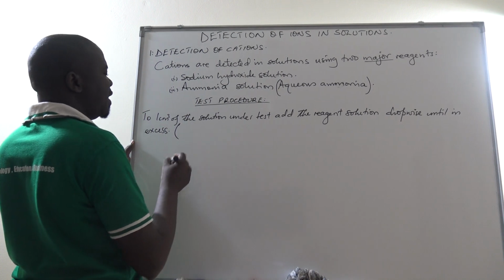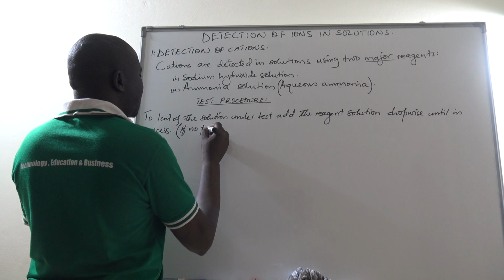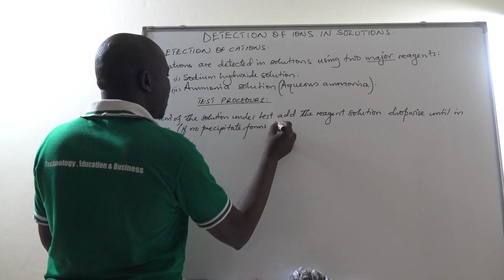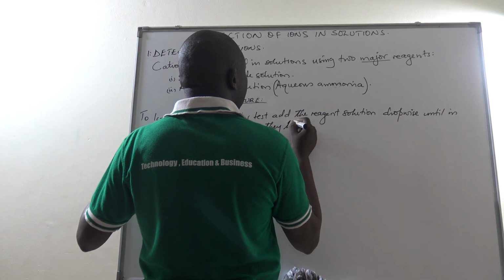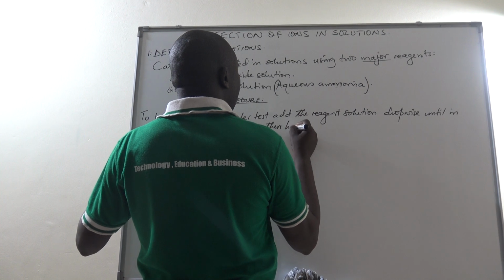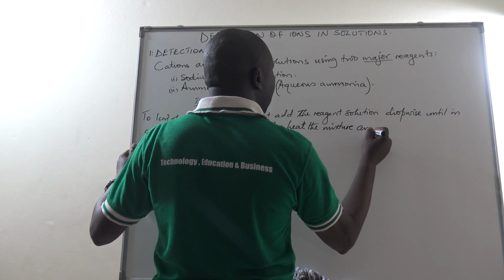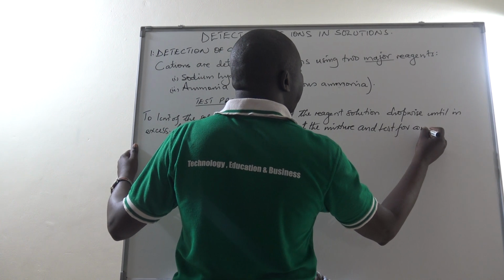I want to add something here. If no precipitate forms, then you will be asked to heat the mixture and test for ammonia.